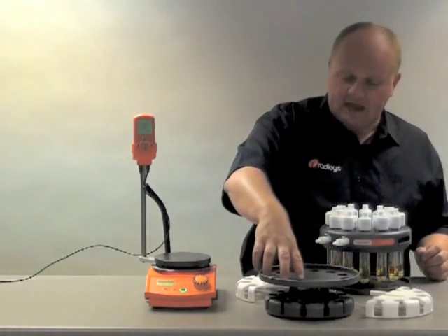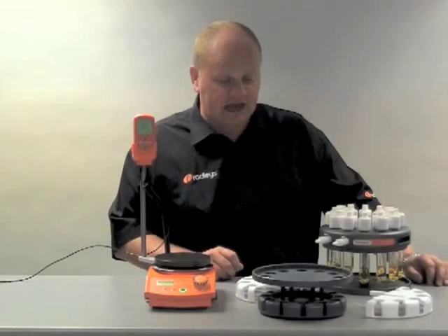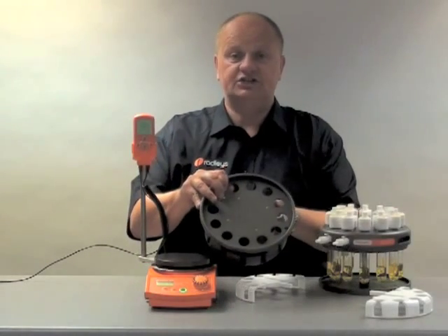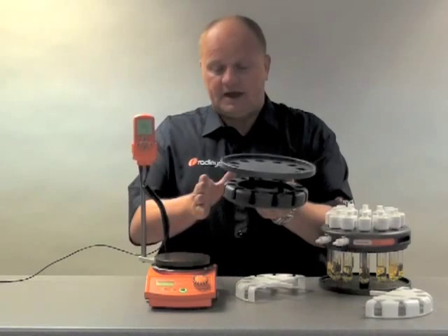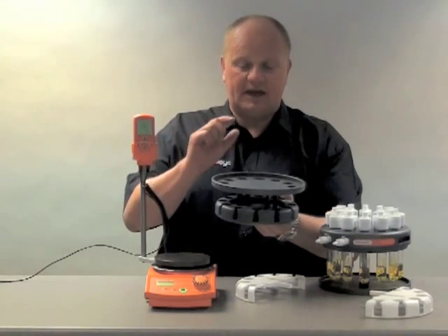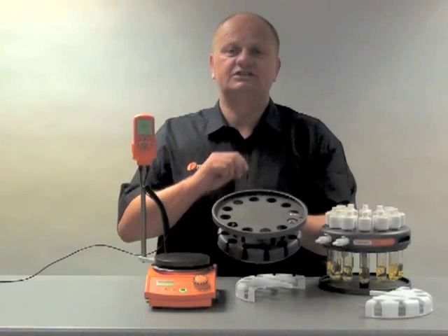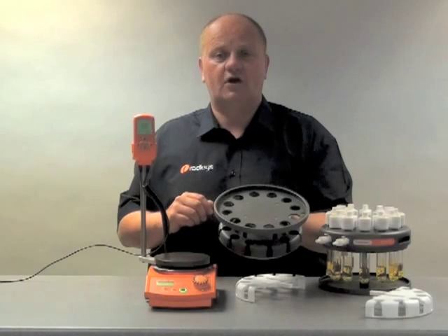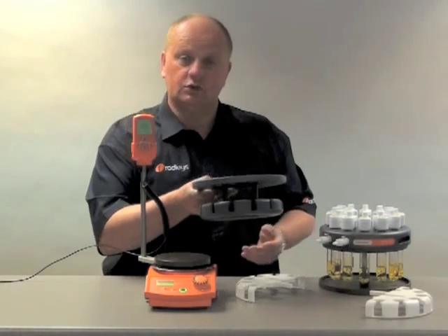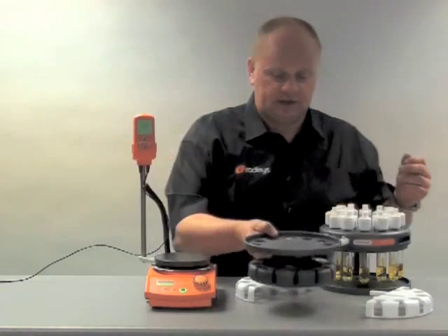Let's take a look at it. This is the base. The base has 12 positions. The base is the part of the device which is heated and it is covered with a fluoropolymer coating which gives it chemical resistance. This is very similar to that which you'd find in a frying pan but much much harder. The base is also manufactured from solid aluminium which is ideal for transferring the heat.